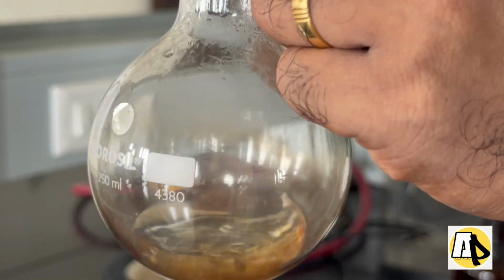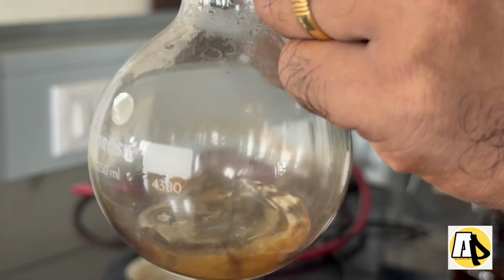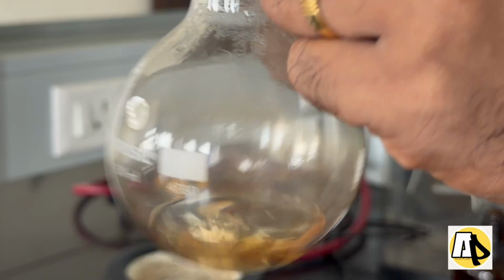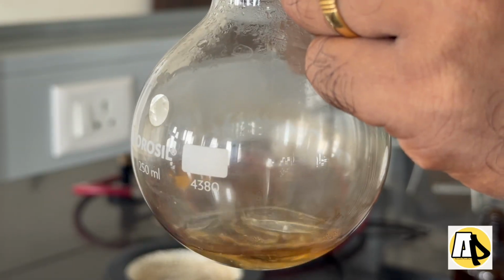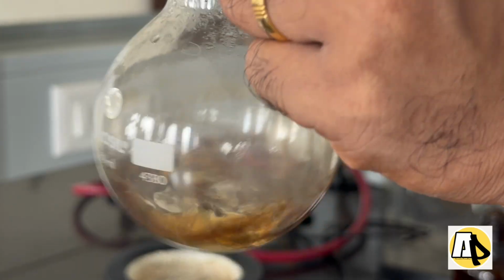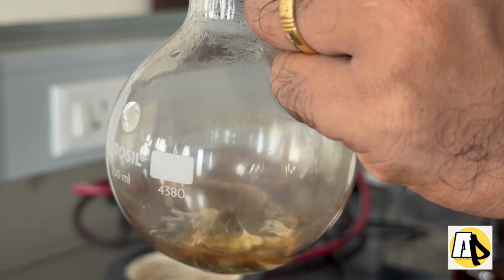That is the cloudy precipitate of salicylic acid. Until the complete exhaustion of all the liquid in the RBF happens, we will keep on adding HCl dropwise into this system.